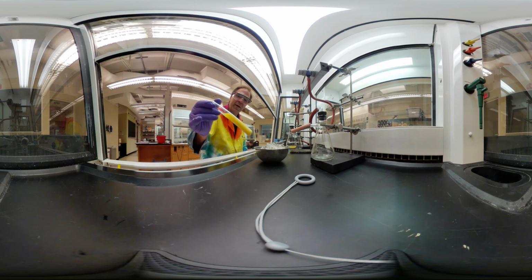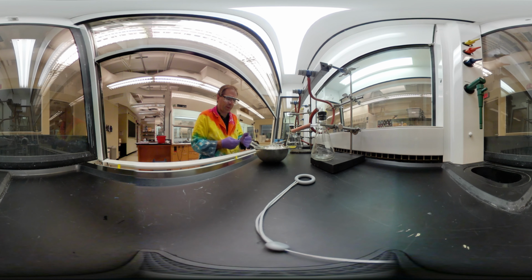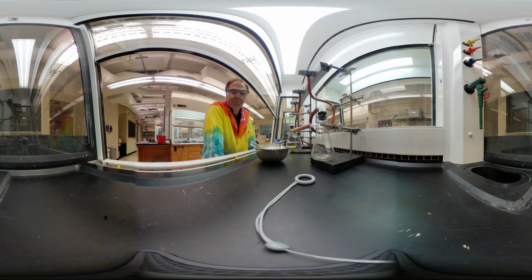All right, a lot of solid throughout here. While this finishes cooling down, let's talk about the characterization a little bit. There are multiple techniques that we could use. Of course, as we've been talking about all semester, we're going to do IR, but we could also do NMR. We could do mass spec to make sure we've made the product that we wanted.